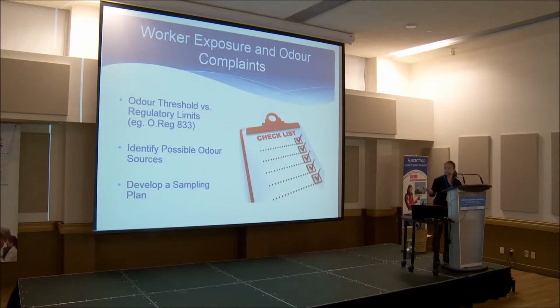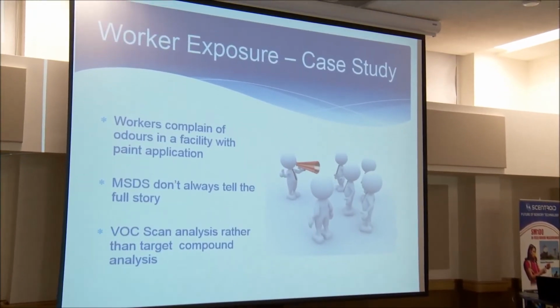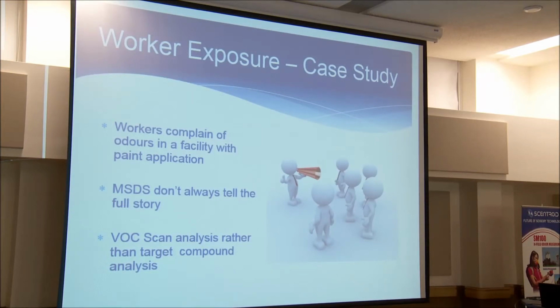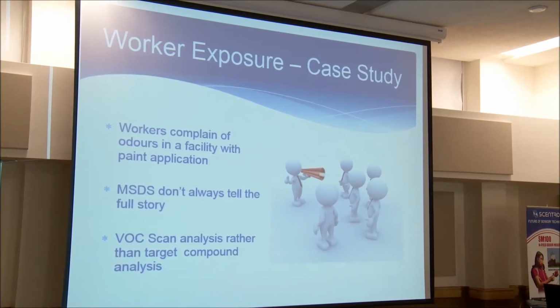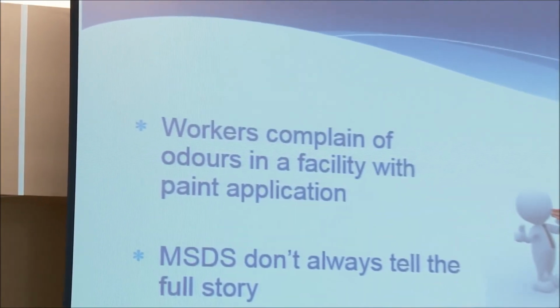Just because you smell it doesn't mean that there's some sort of health risk within that facility. So it's important to look first at what the possible sources are, and then develop a plan to actually find out what's going on within that facility. In this particular situation, there was an odor complaint at a facility, generally in the area where paint application was being done, but there are other things being done at this facility as well.